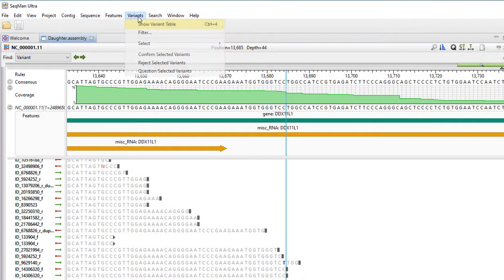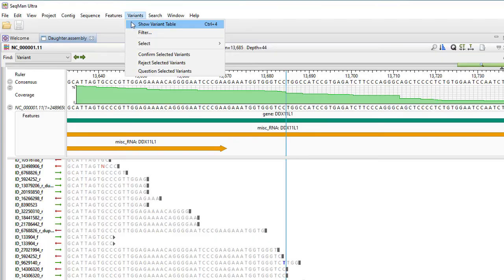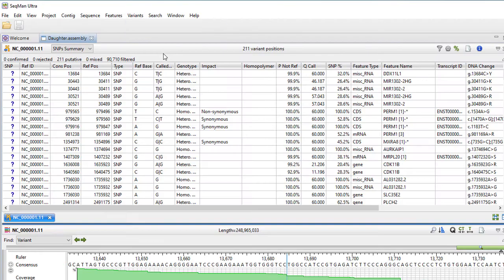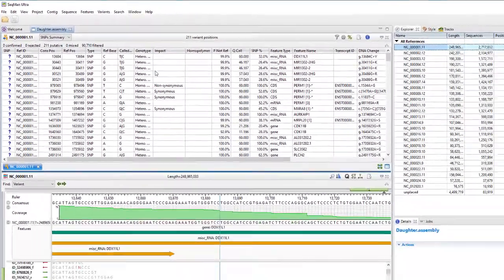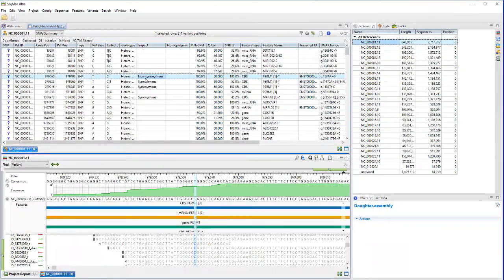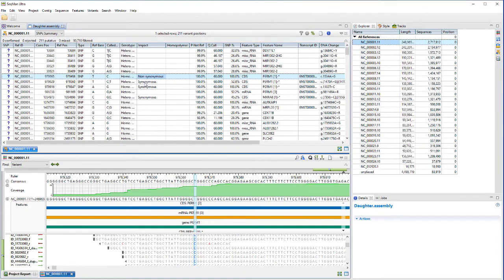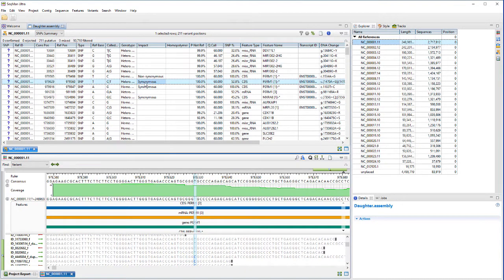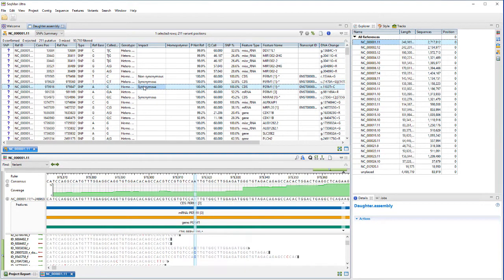You can also see a list of variants by going to Variants Show Variant Table. This table is interactive with the alignment view, so you can use it for navigation as well as filtering.